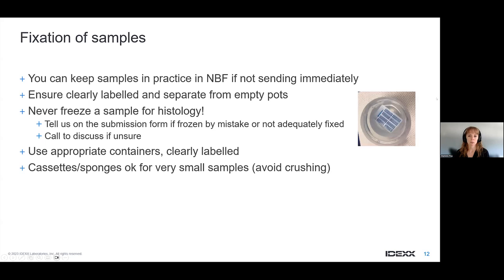And as seen in this picture here, you can use cassettes if you have a very small sample, for example endoscopic biopsies, or a very small skin biopsy or very small mass, or sometimes, for example, endoscopic biopsies of the nasal cavity.